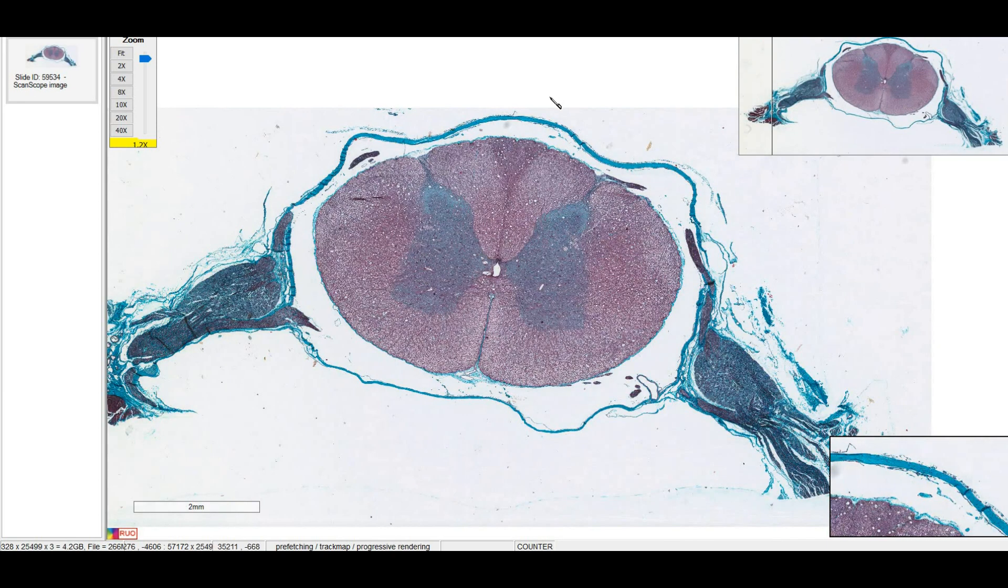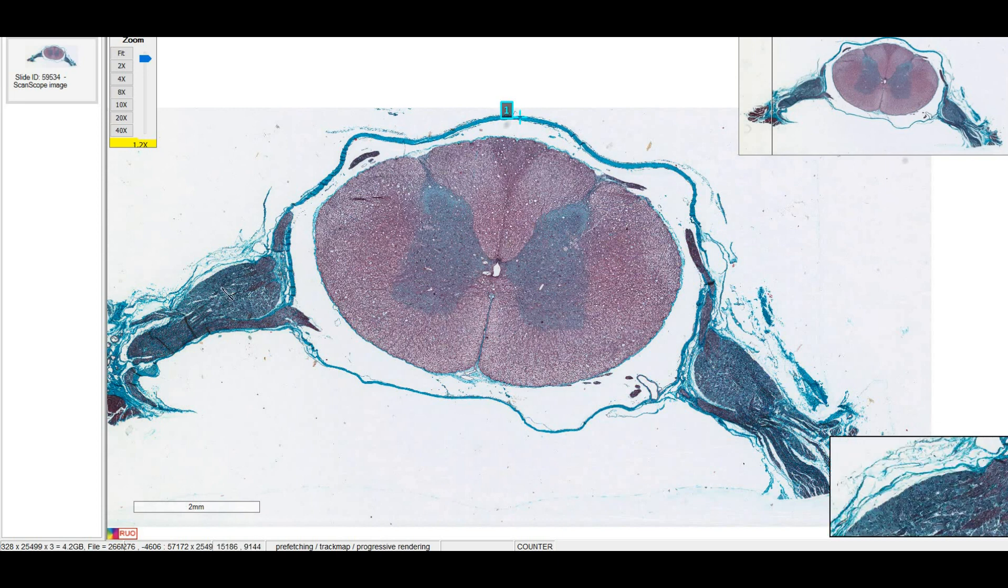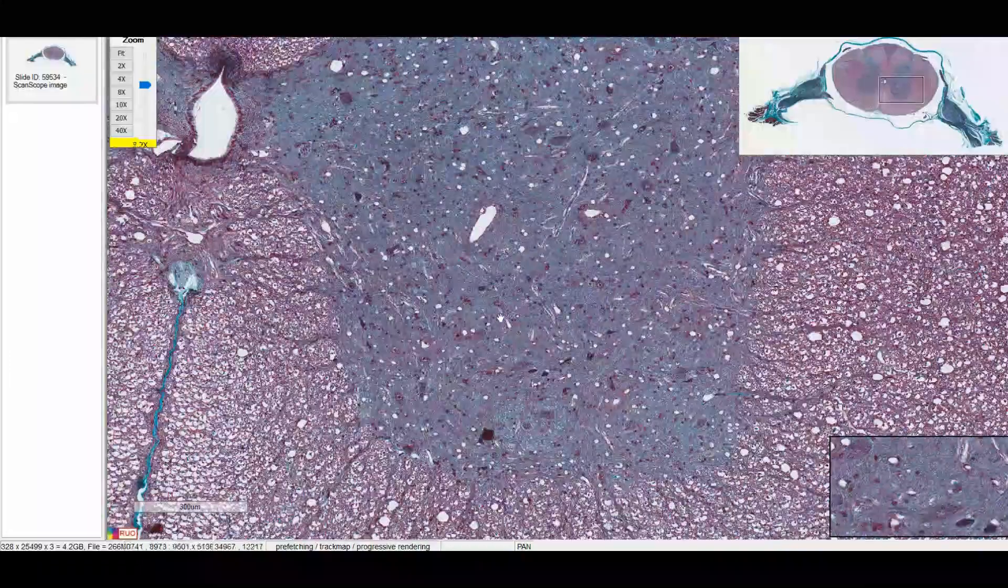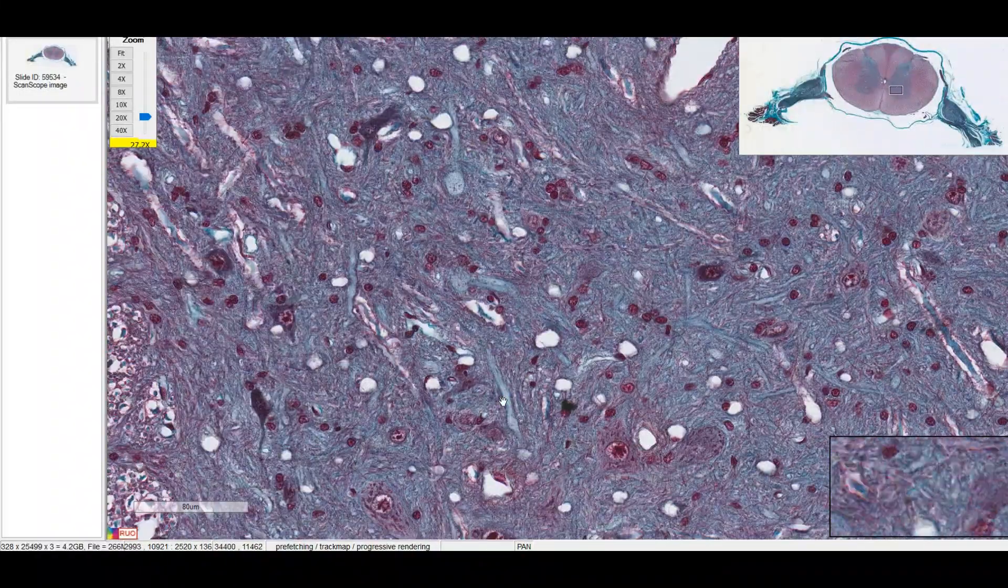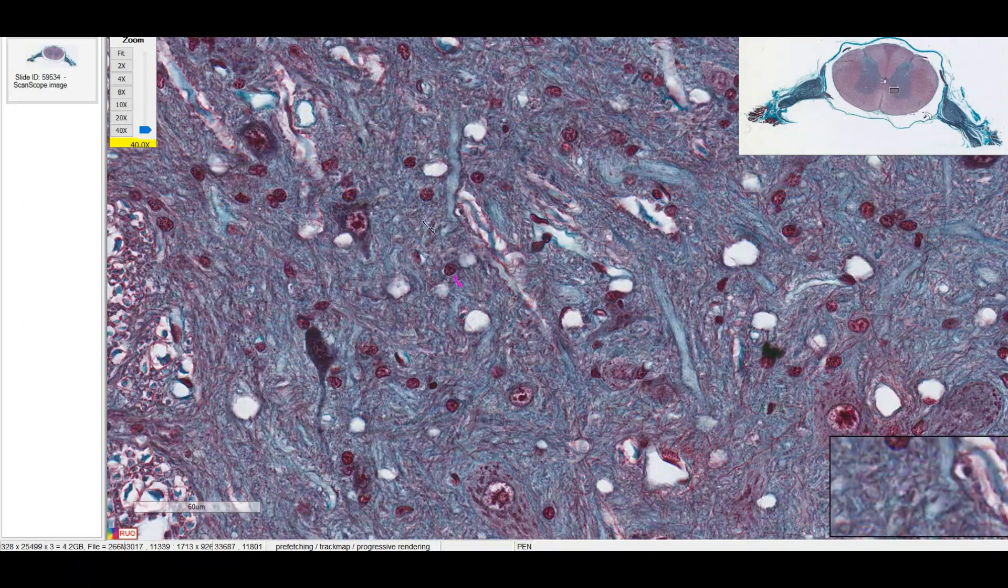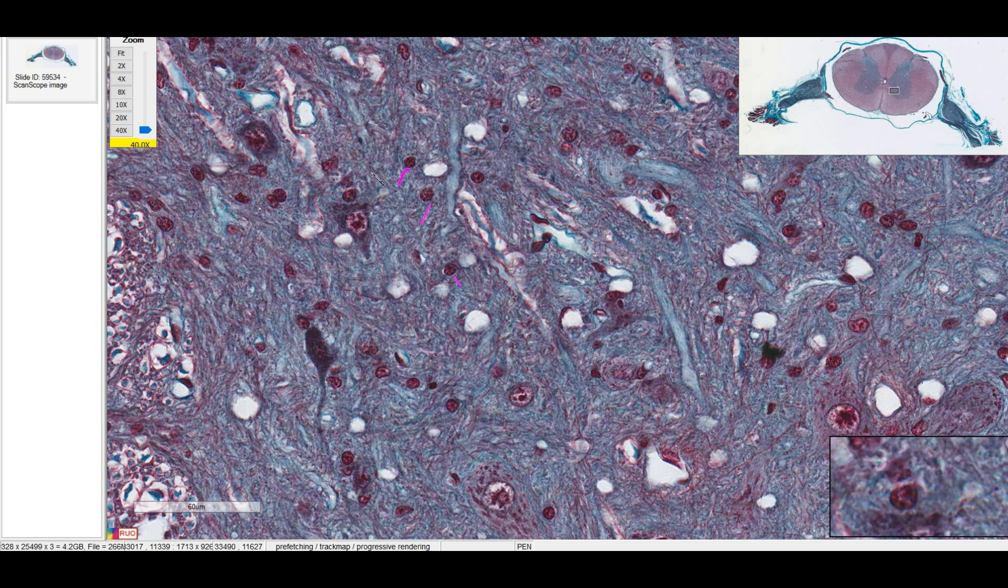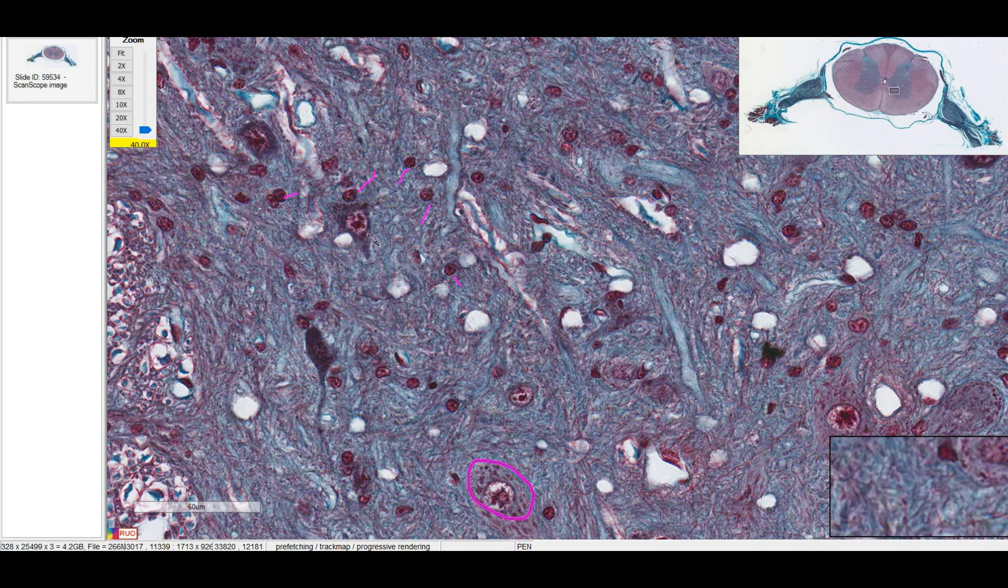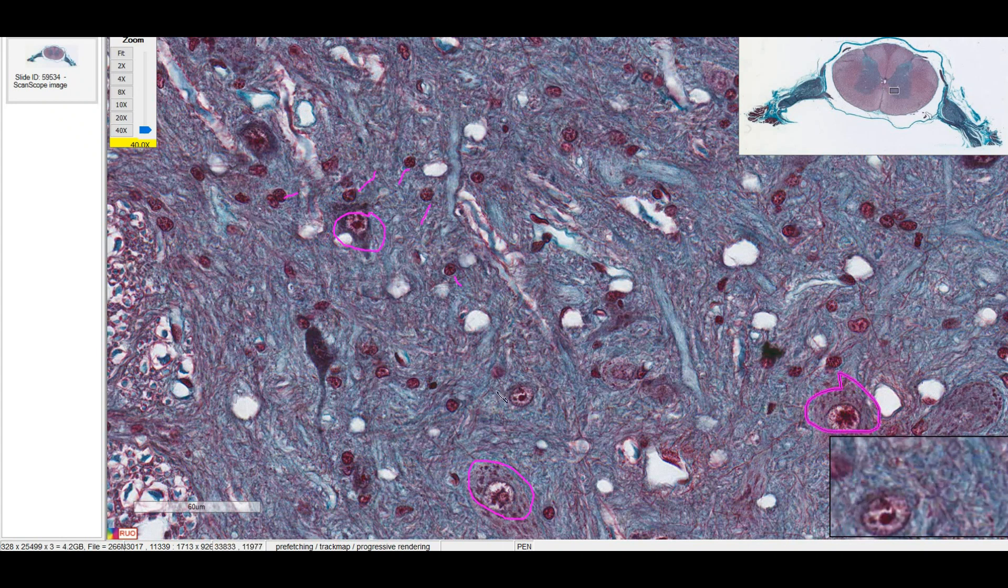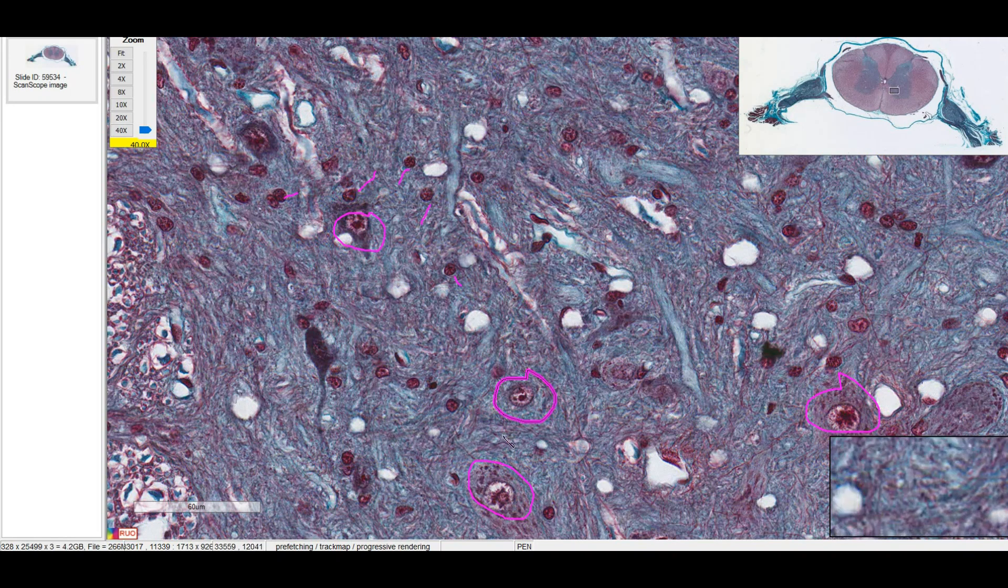Moving on, on this slide we can see the spinal cord with the meninges and the dorsal root ganglia on either side. Now let's jump into the ventral horn. We can see that the color scheme is very different here. This is a trichrome stain where the neural glial cells, these little guys right here, their cytoplasm is red. We can see the neuronal cell bodies that their nucleic acids now they're staining red. And all this stuff in the middle is neuropil. These are all the cellular processes of the neurons and the glial cells.